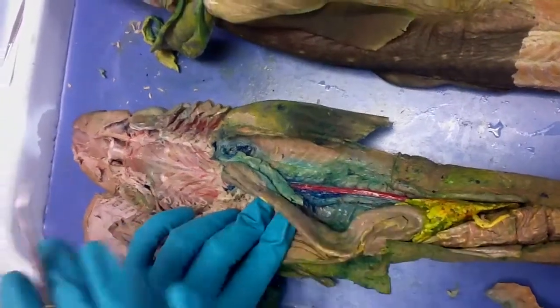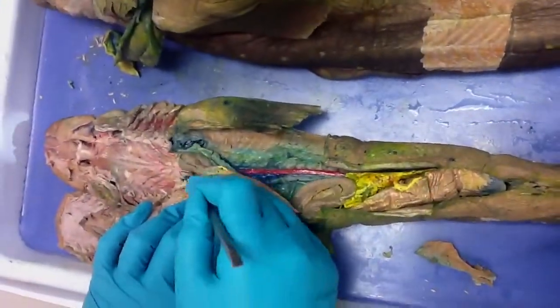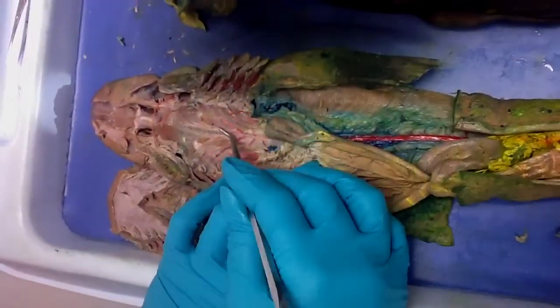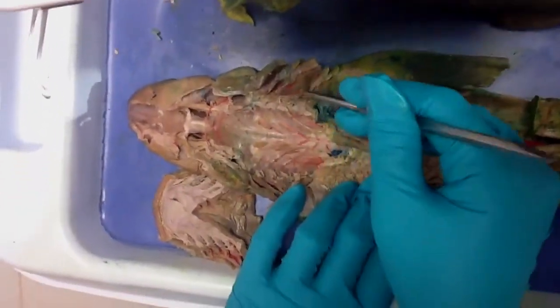This is the arterial system, and it is a much deeper dissection than we've done in this shark. We can still see the dorsal aorta. It comes here and it branches off to all of the different efferent arteries that are supplying the gills. So all of the branches are the efferent arteries? Efferent, yep.